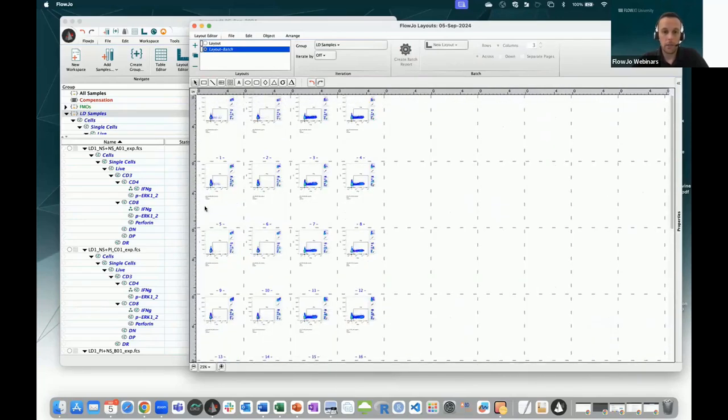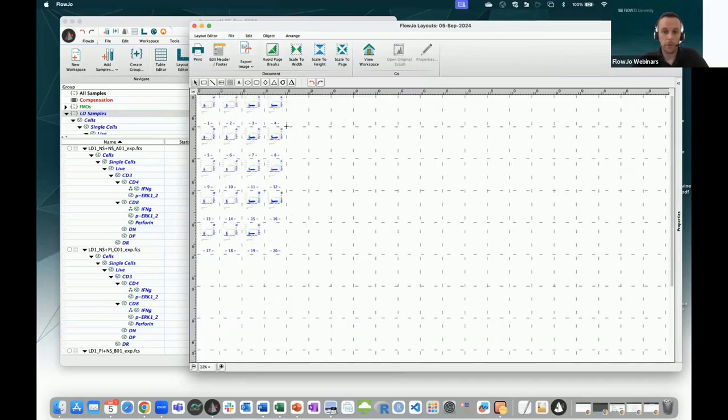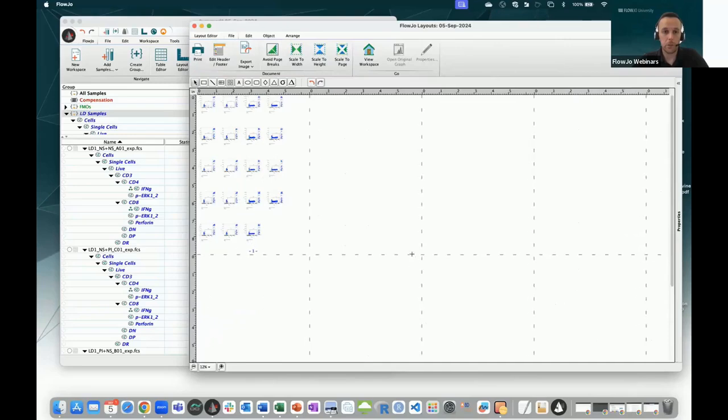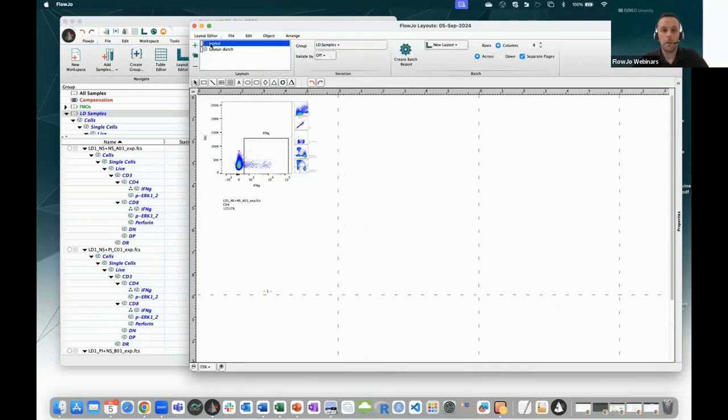I can see on my page. I can save that, save export PNG, JPEG, PDF, or whatever, or I can change the number of pages by just clicking on the angle of the page, and maybe I want to display that only to 1 page. And there you go. I select 1 page, and I can save it again.